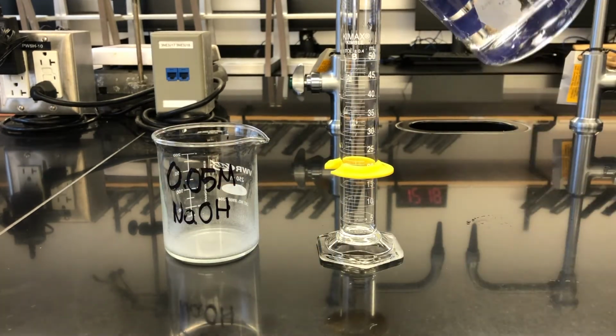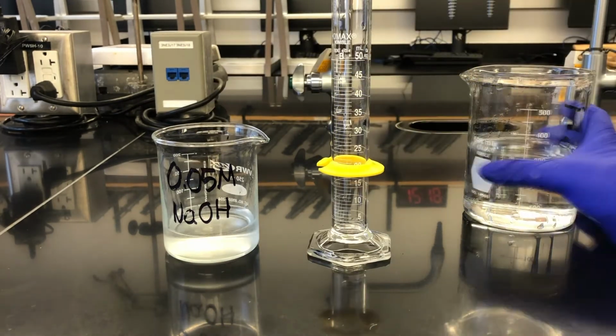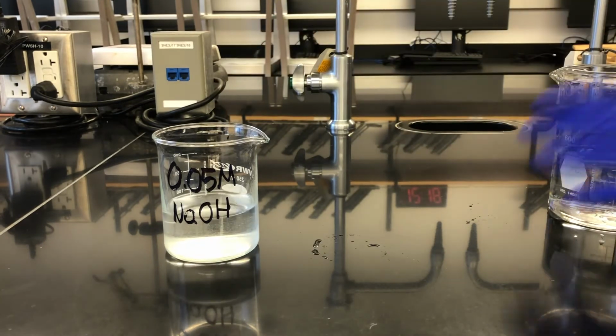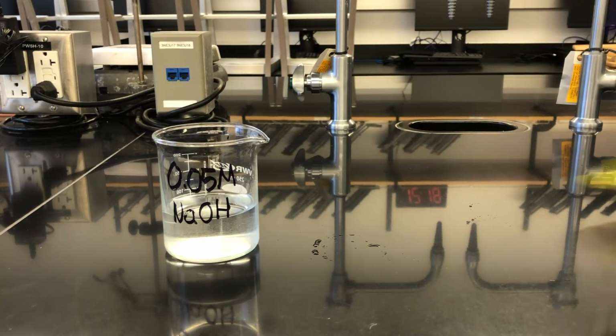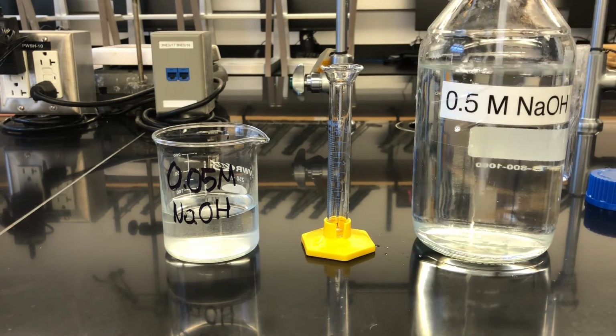Next, we prepare 100 milliliters of 0.05 molar sodium hydroxide from a 0.5 molar stock solution. We do this by first measuring out 90 milliliters of deionized water, and then adding 10 milliliters of 0.5 molar sodium hydroxide stock solution.